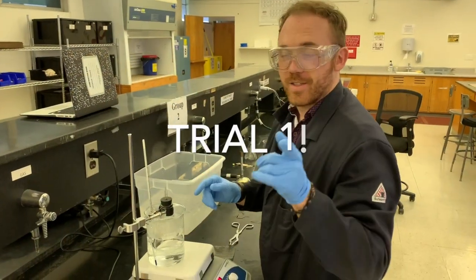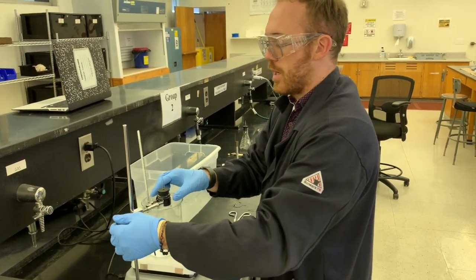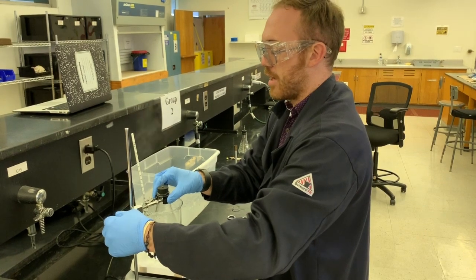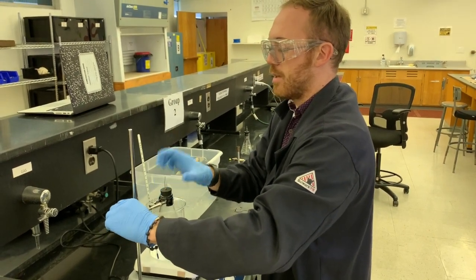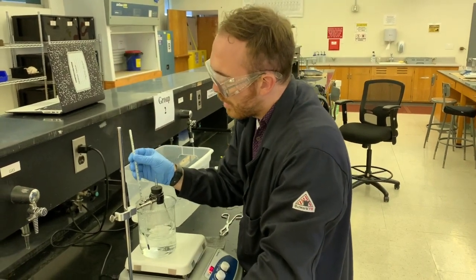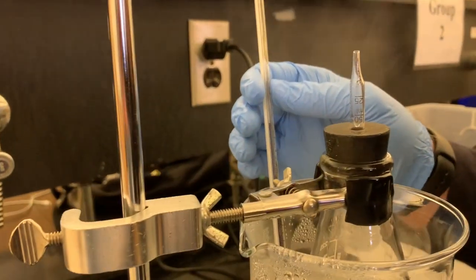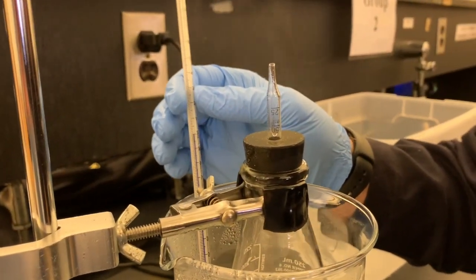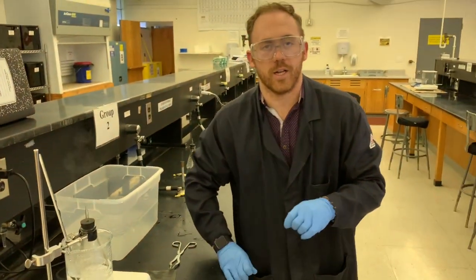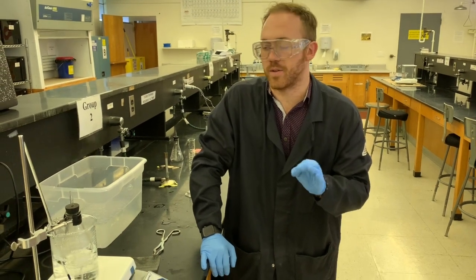Hey everybody, so welcome back. It's been boiling for about 5 minutes and we're going to take this off. Unfortunately, I think it was pretty hot because you can still smell the burning plastic. Before we actually move this, we're going to take the thermometer and check and record the temperature. So right now, I have it screaming boiling hot and we're running at about exactly 101 degrees Celsius. You're gonna have to convert that to Kelvin eventually, but it's a valuable thing to just keep tabs on those temperatures as often as you can.